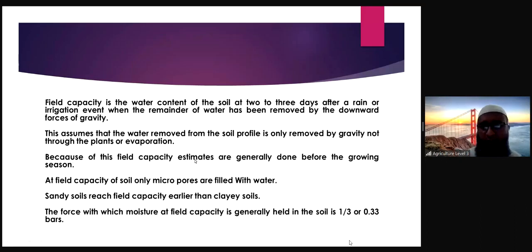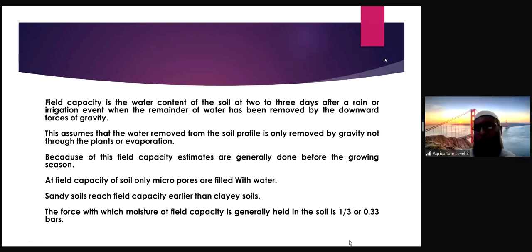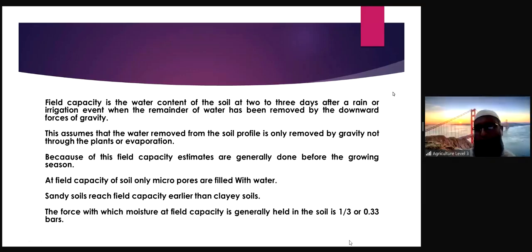How can you stop transpiration by plants? We are not stopping transpiration, but the water being transpired by the vegetation will be trapped by the polythene sheet.